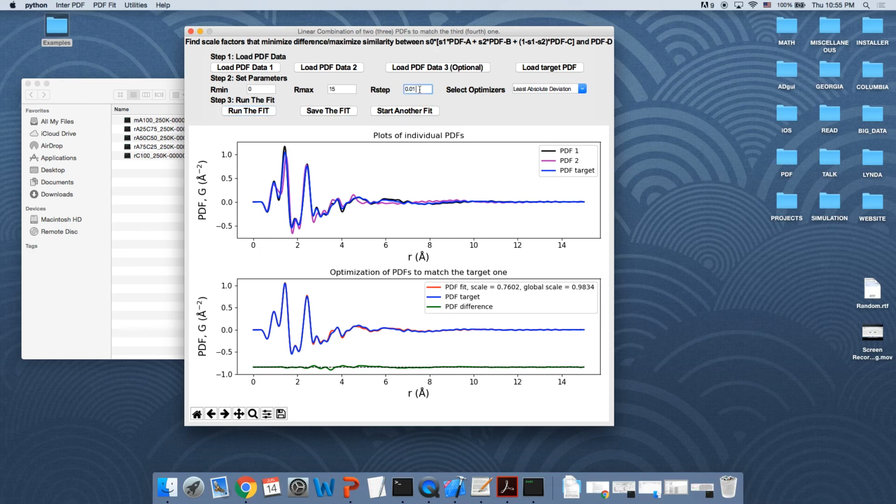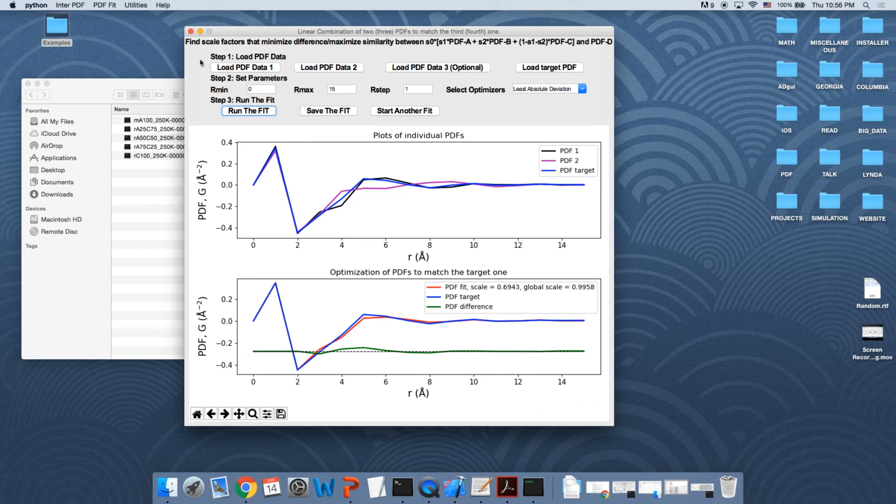And you can change the steps as well. It's 0.02. You cannot see the difference. Let's see, 0.1. Yeah, it becomes rugged, and say 1. Yeah, that's too much.